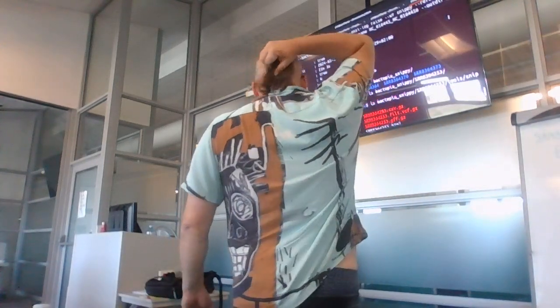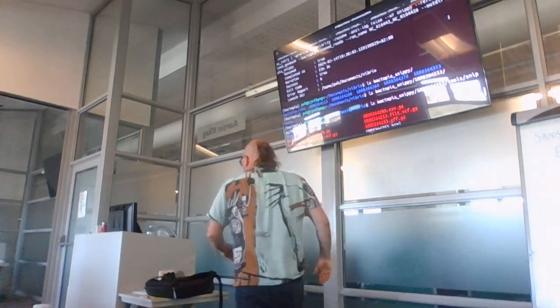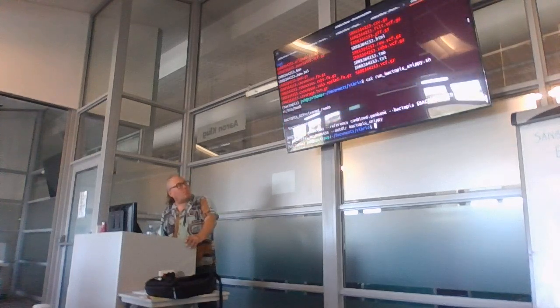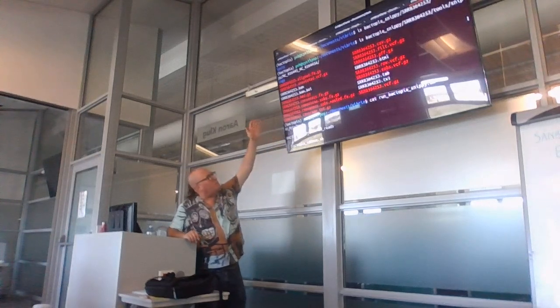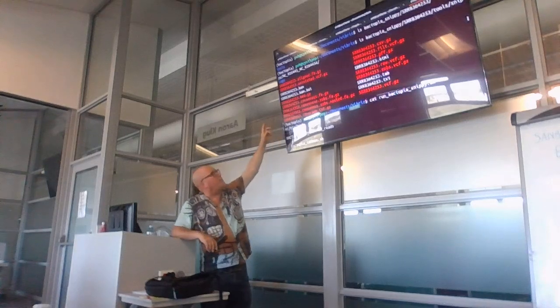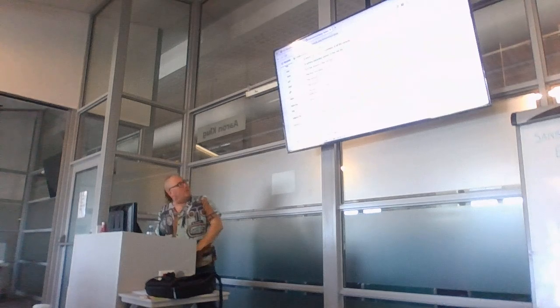And then inside that folder, you can see all of these files, okay? And these files, broadly speaking, correspond with the files that are mentioned on the Snippy webpage, okay?